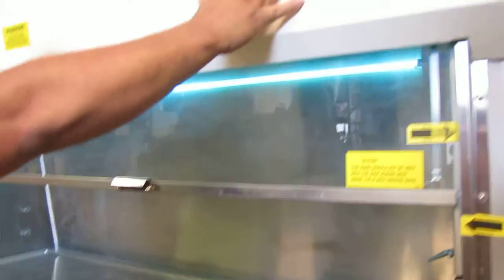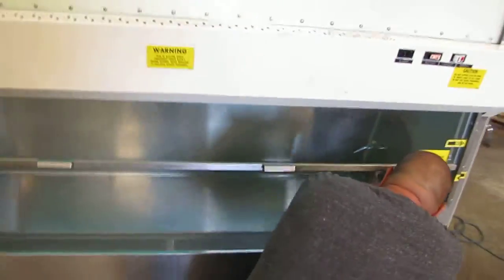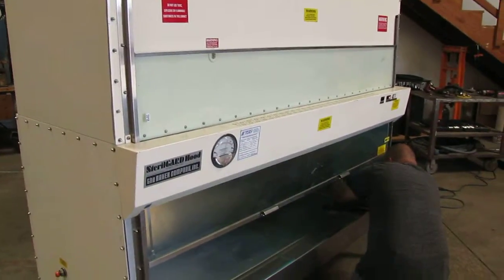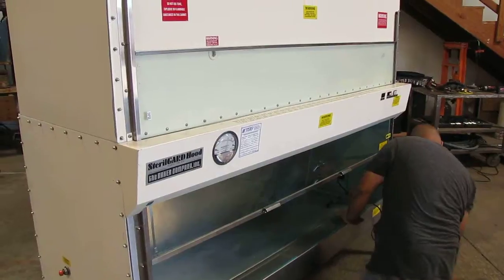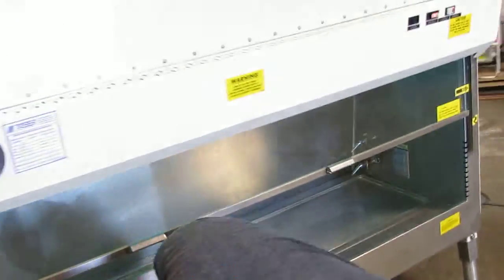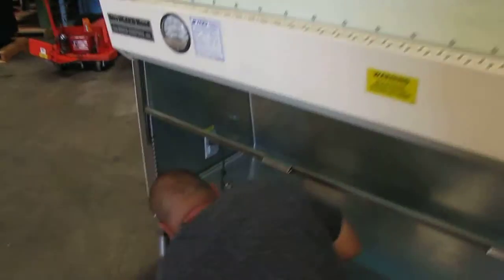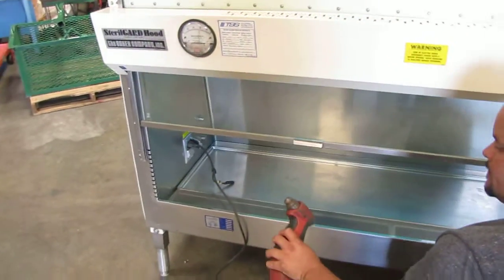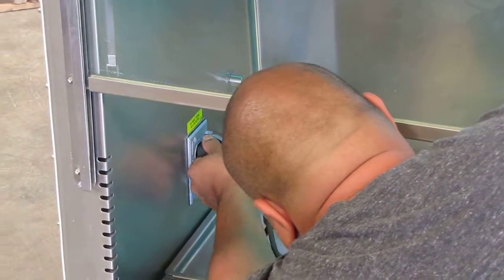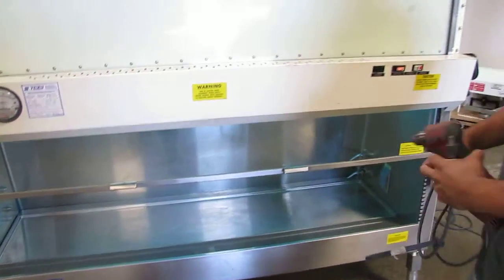Next thing we're going to do is test the receptacles. We've got a couple of receptacles on the loose end, so we'll try both ends. As you can see, this hood is in fully working condition.